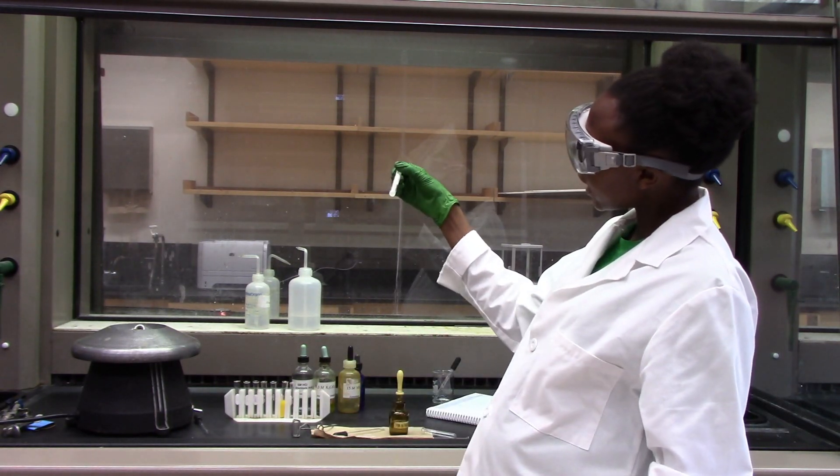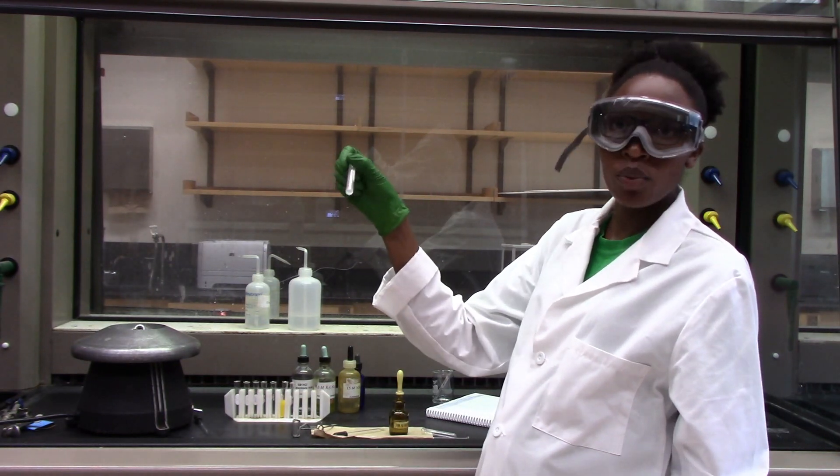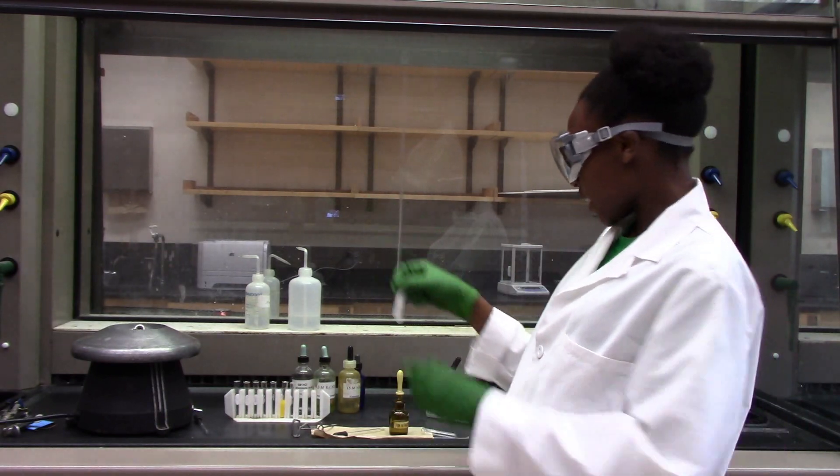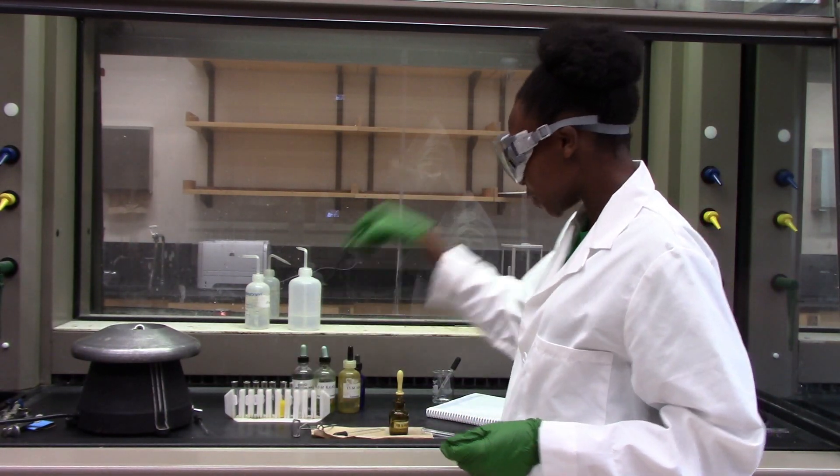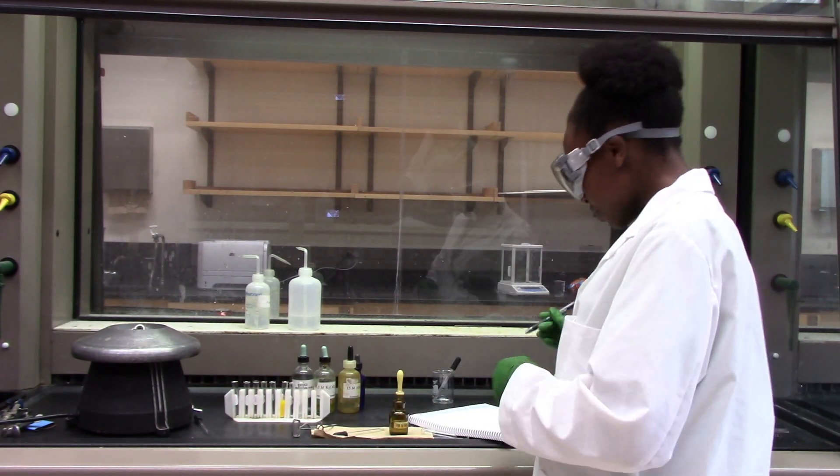Again, as you can see here, my solution has a white suspension to it. So we have a white precipitate. I'm going to note this observation down in my notebook that after adding nitric acid, I have a white precipitate.